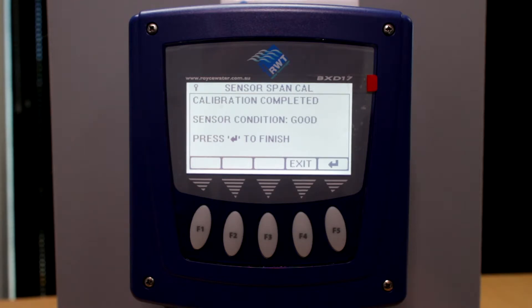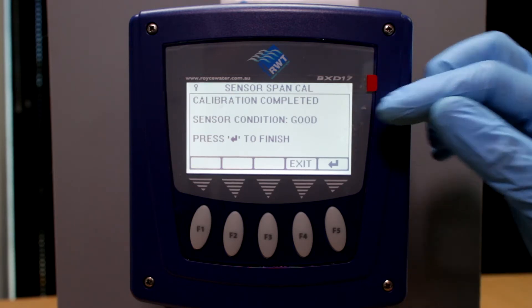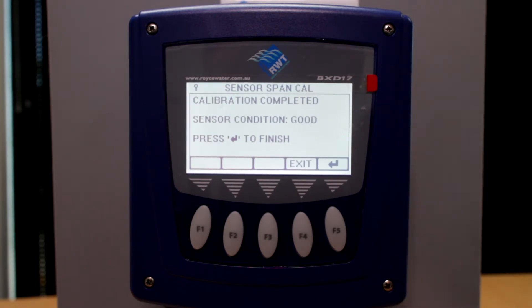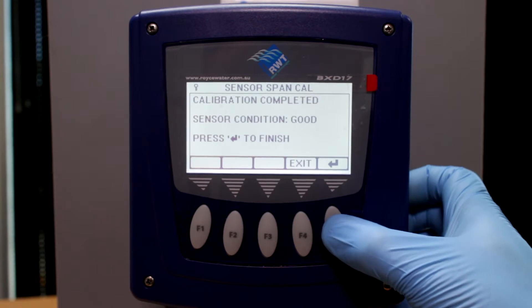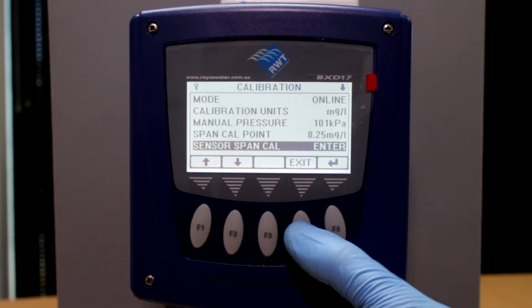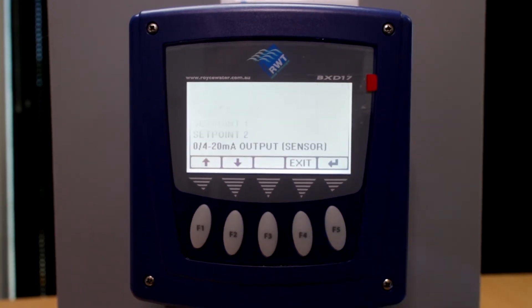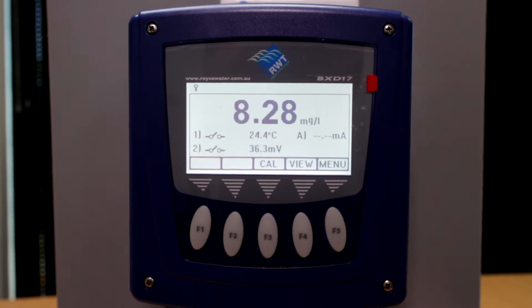Once calibration is complete, the BXD will tell you the calibration has been completed and give you a report on the sensor condition. Push enter to complete, F4 exit, and F4 again, and you're back to your readout.